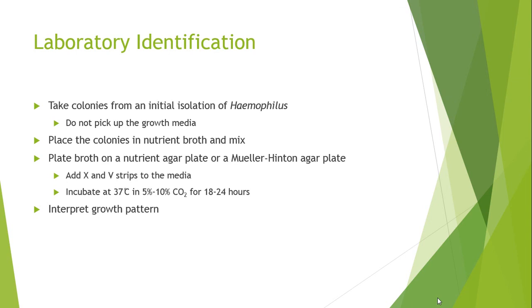We're going to make a suspension and then we're going to plate it on a nutrient agar or a Mueller-Hinton agar plate that's designed for Haemophilus. And we'll do a little bit of this today. I don't have X or V strips, but we'll do antibacterial testing just so you can kind of see what it's like. And then you put the strips on the media and you incubate it in CO2 because it's a capnophile, 18 to 24 hours, and then you interpret the growth pattern.